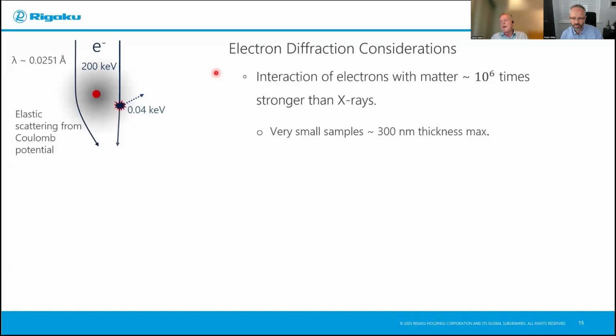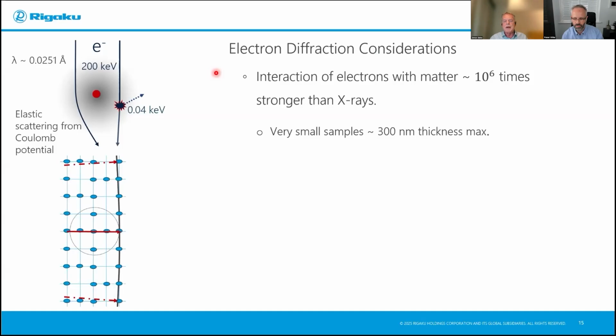We can go up into the microns laterally. But because the sample is rocked during the measurement, we don't want the sample to be too extended, because as you tilt to 50 degrees or so, the electrons are going to have an oblique pathway through the sample, and it might be too far. Now, on the thin side, what is the thinnest sample we can look at? Typically, we say around 30 nanometers or thereabouts. That should give you enough material to give a pretty good diffraction signal. So that gives an order of magnitude range from 30 nanometers to 300 or so nanometers as a good size, and that's on the thickness. The lateral extent can be smaller or larger than that, as needed.